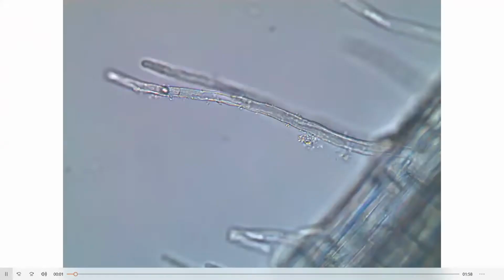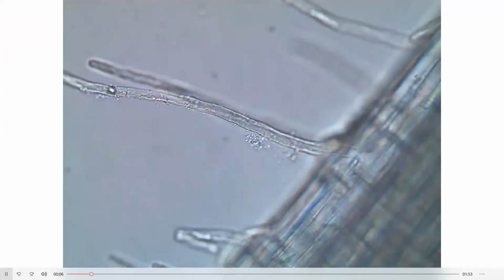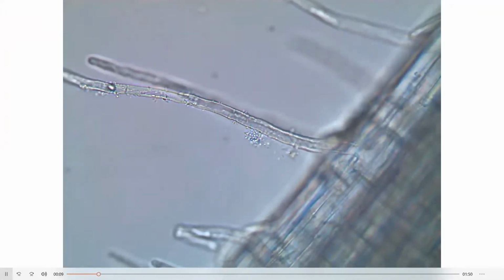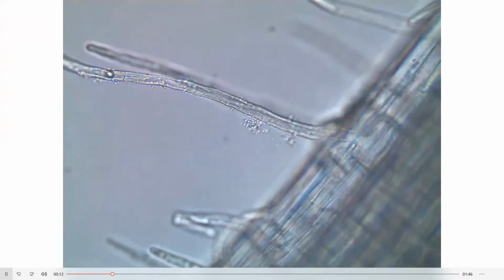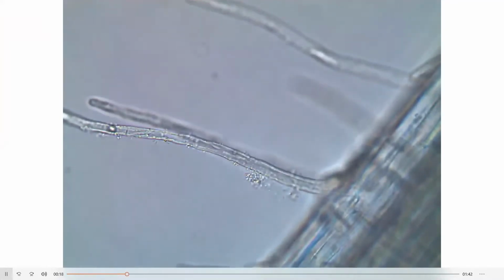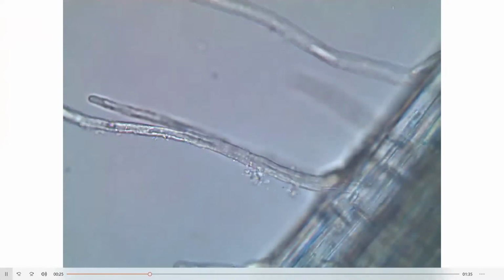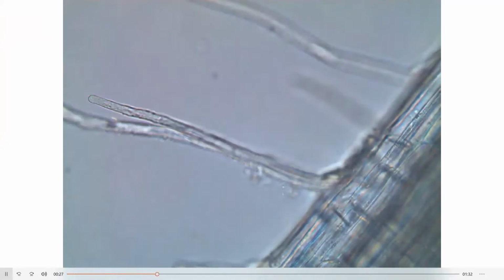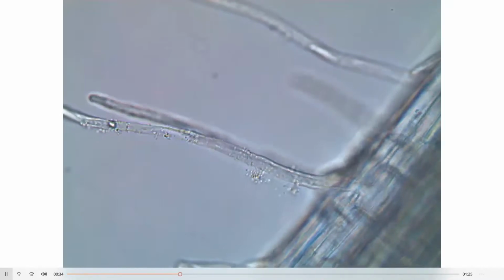Cells are not static dead things, so while I was looking around at the roots, I noticed all this beautiful cytoplasmic streaming going on. So this is movement inside of these root hair cells, and this is caused by various types of cytoskeletal components that literally walk the various organelles and structures inside of the cell along the cytoplasm of the cells. So you can kind of see that movement here in this slide.